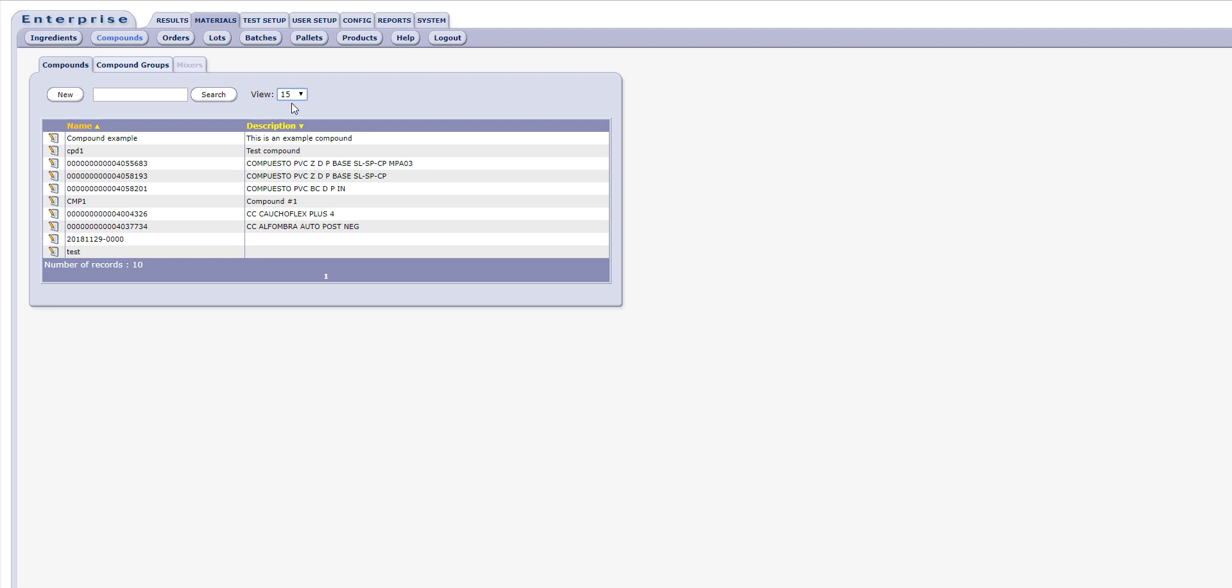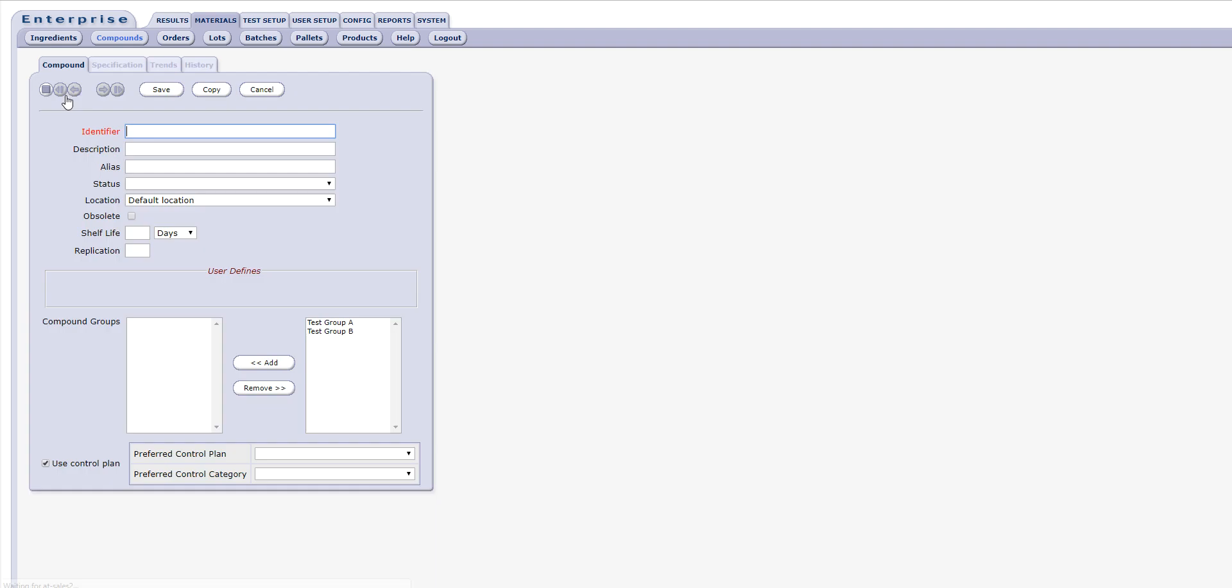To add a new compound, simply click the New button at the top of the compound form. This opens the compound editor form.